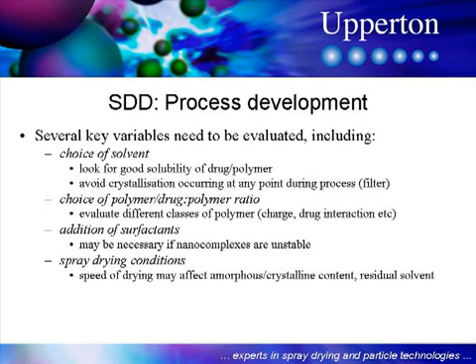So quite often it's usual to filter the drug polymer solution before we spray dry to remove any traces of crystalline drug. The second aspect we need to evaluate is the choice of polymer and the drug to polymer ratio. We need to evaluate a range of different classes of polymer. Polymers of different charge will have different interactions with the drug, so we need to screen a number of polymers before we arrive at the best polymer for that particular drug.